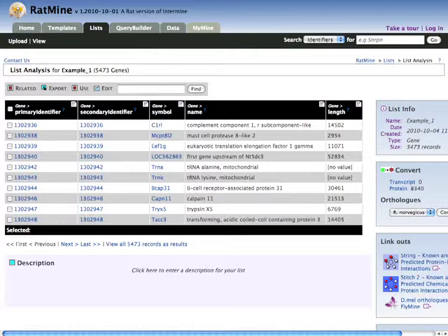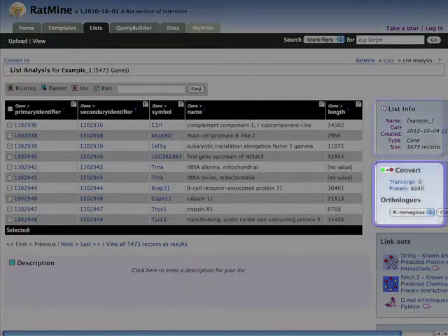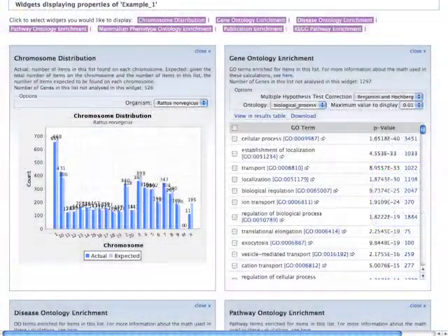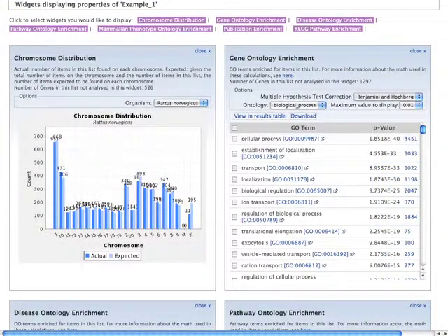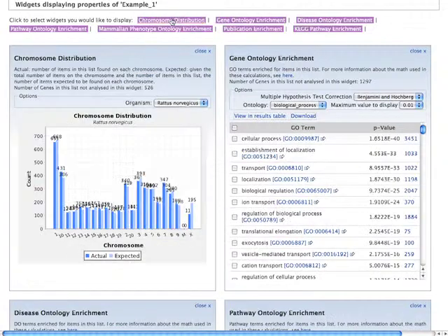You can see that at the top of the page, information is given about the genes in this list and about the list itself. You also have an option to convert the objects in the list from genes to their corresponding proteins. Below this information are the Ontology Term Enrichment widgets. Across the top of this section is the list of available widgets. By default, they are all highlighted, meaning that they are all being displayed. To turn one off, click the widget name in the list. To turn it back on, just click it again.